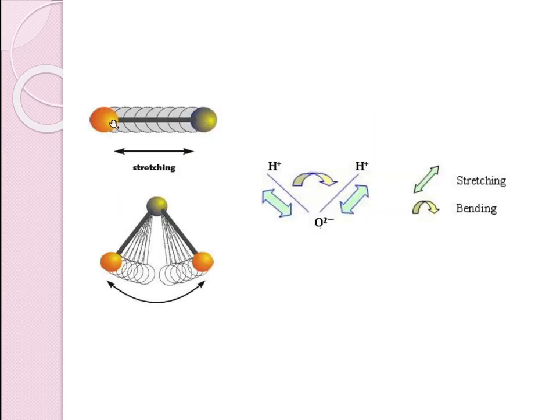Stretching means that the bond gets stretched and the distance between atoms increases or decreases. And bending means they will bend, they will move from here to there.